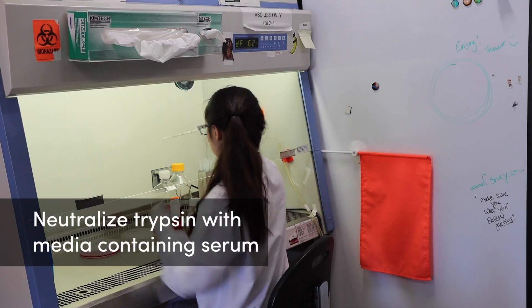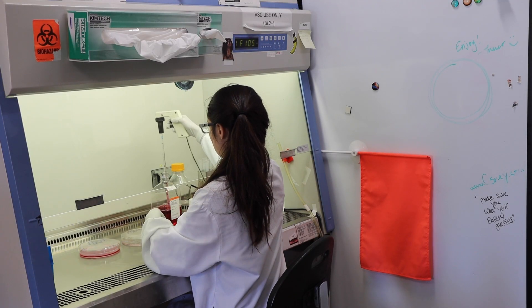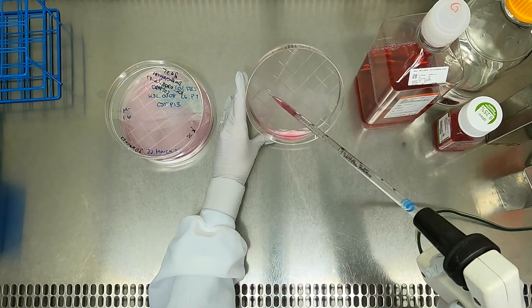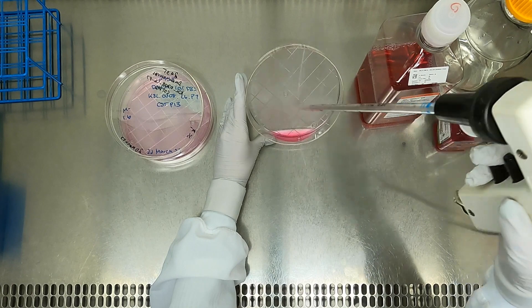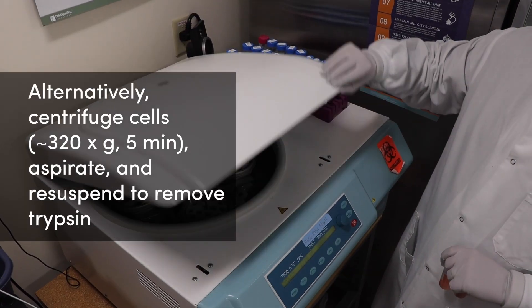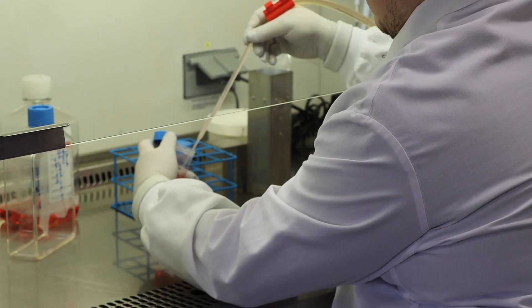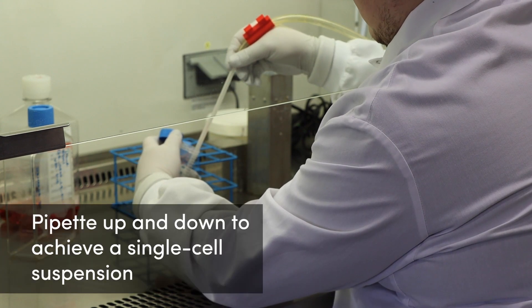Once you observe the cells detaching and lifting from the surface, the trypsin needs to be neutralized. This can be done by adding media containing serum. Generally, you should add at least twice the initial volume of trypsin. So for our example of 2 mils of trypsin, add double the volume or 4 mils of media with serum. For cell lines that require serum-free media, trypsin is instead removed by spinning down the cell suspension, followed by aspirating the supernatant. Then the cell pellet can be re-suspended in fresh cell culture media.